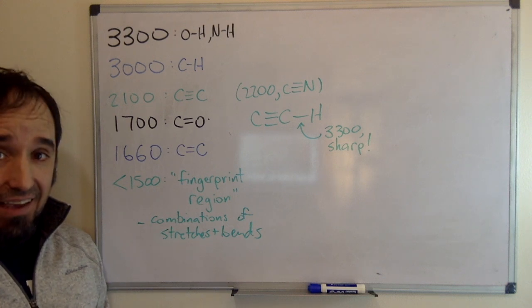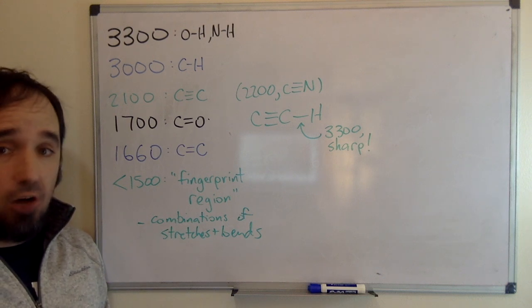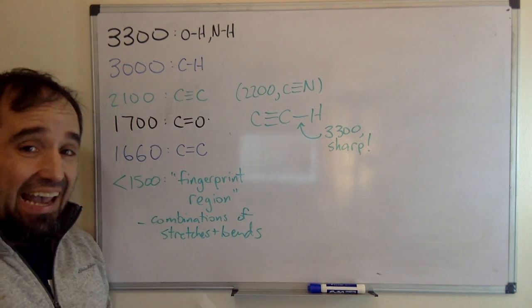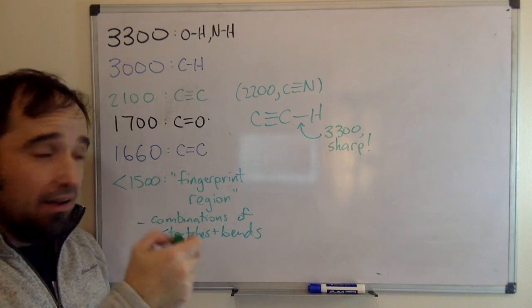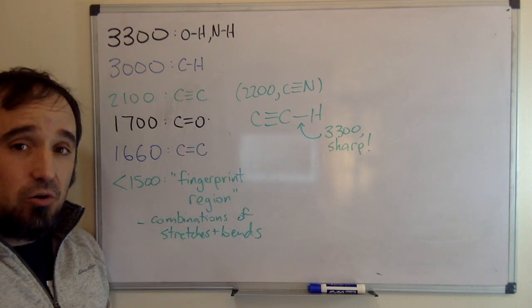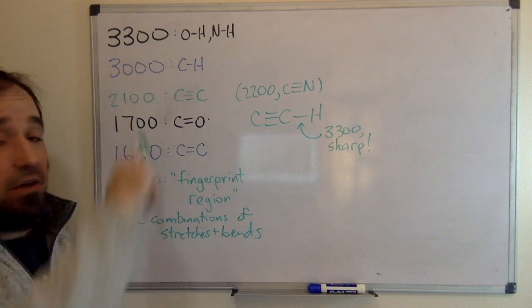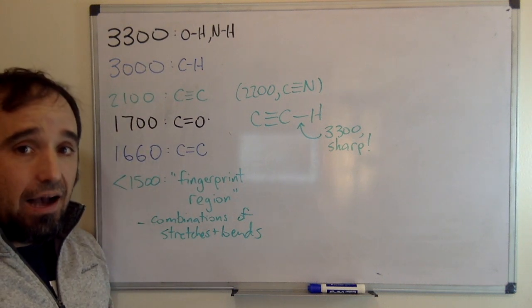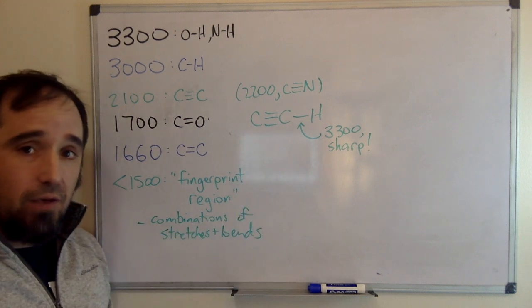There's usually a big gap in an IR spectrum between 3000 and 1700. If there is something in that gap, it's probably a triple-bonded carbon. So CC triple bond around 2100, CN triple bond, a little bit stronger bond, a little bit higher frequency, 2200. One thing I should have put up here, an alkyne CH is actually quite high. It's around 3300 wave numbers.